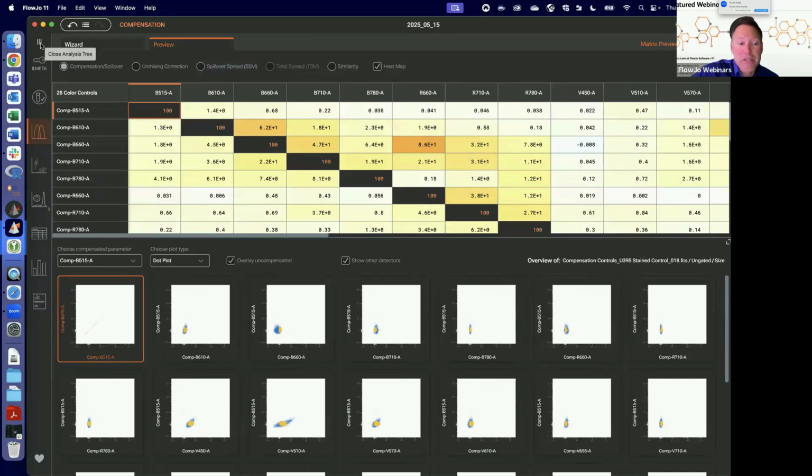We can give more space to our preview plots if we like. We have decided to follow the course example and pick a specific compensator parameter to show. I think one of the biggest complaints I heard was that our attempt to do the full half diagonal matrix for previews made those unreadable. So now we'll focus on one parameter at a time and make these very readable, I think.